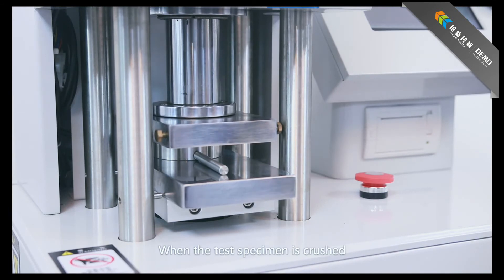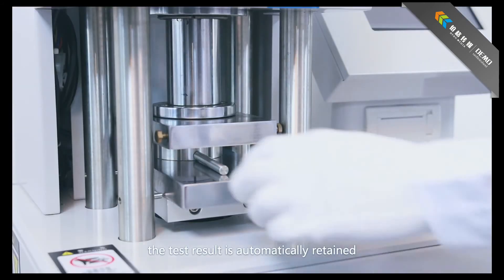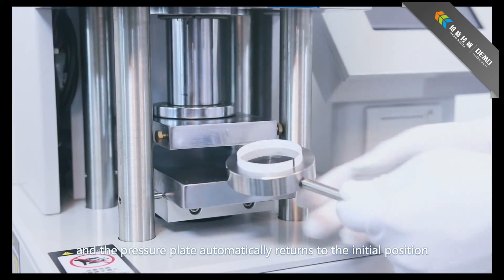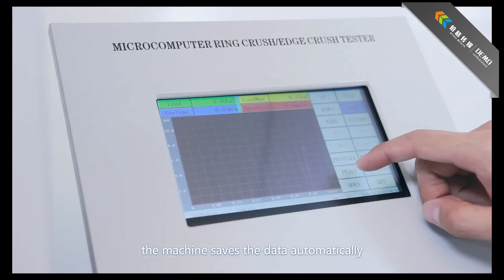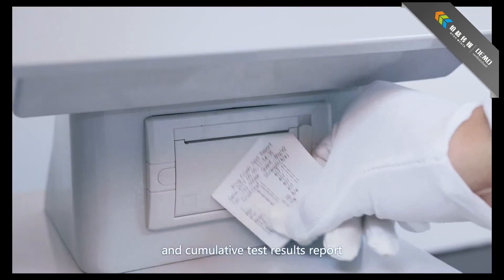When the test specimen is crushed, the test finishes automatically. The test result is automatically retained, and the pressure plate automatically returns to the initial position. Remove the specimen and observe it. After testing is finished, the machine saves the data automatically. Click Open to view the current and cumulative test results report.